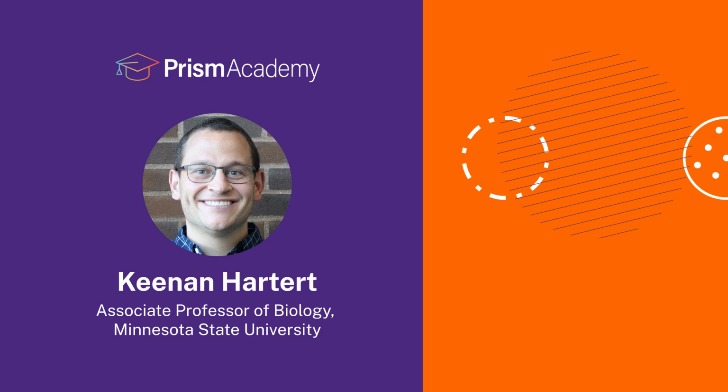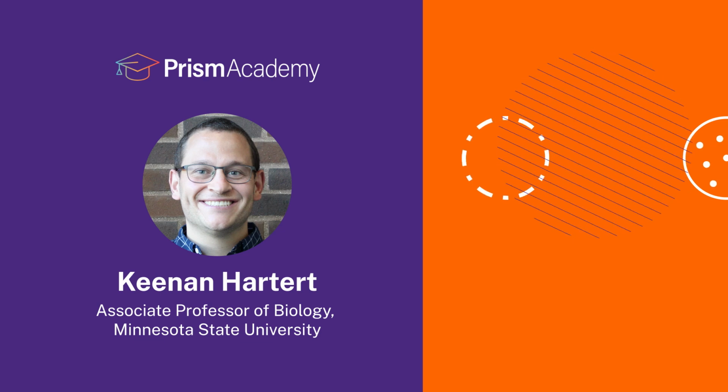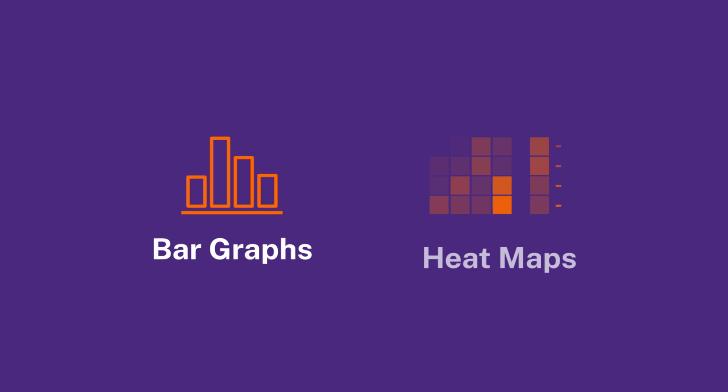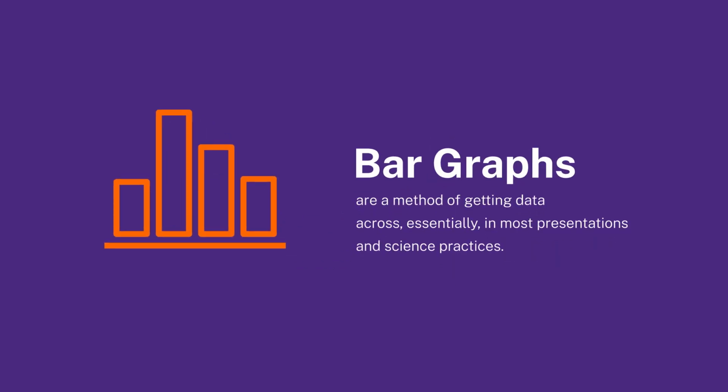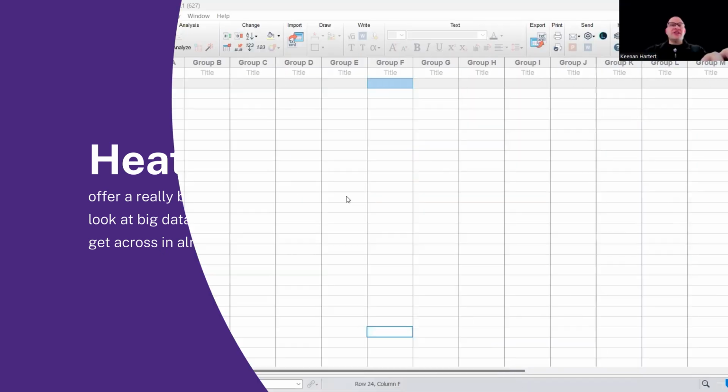I'm a professor at Minnesota State University, and in this video, I'm going to show you best practices for creating graphs with a focus on bar graphs and heat maps. The reason behind this is that bar graphs are probably the universal method of getting data across, essentially, in most presentations and science practices. And heat maps, on the other hand, offer a big multi-dimensional look at big data that is really hard to get across in almost any other format. So let's go ahead and get started.